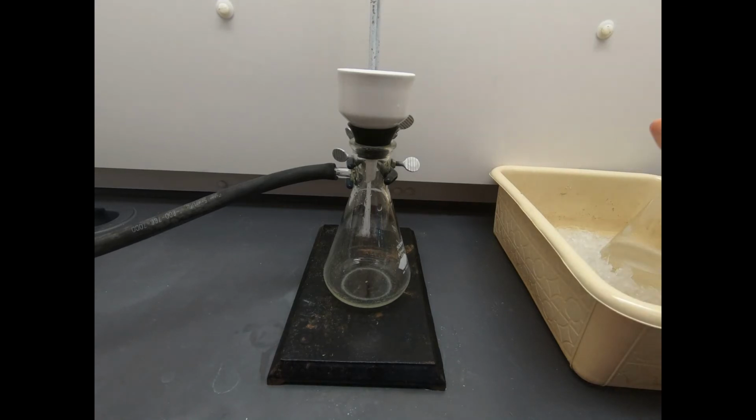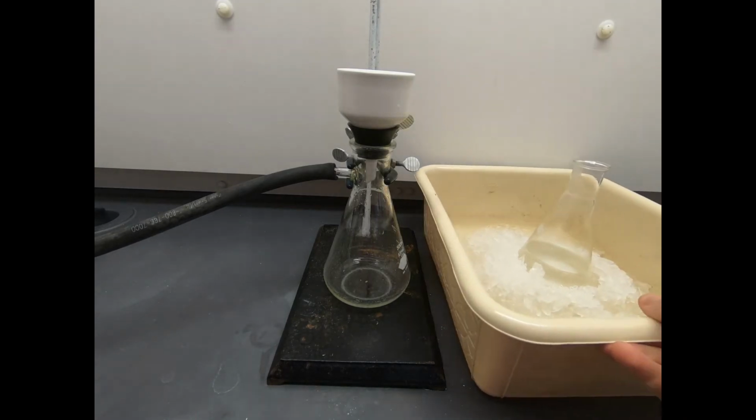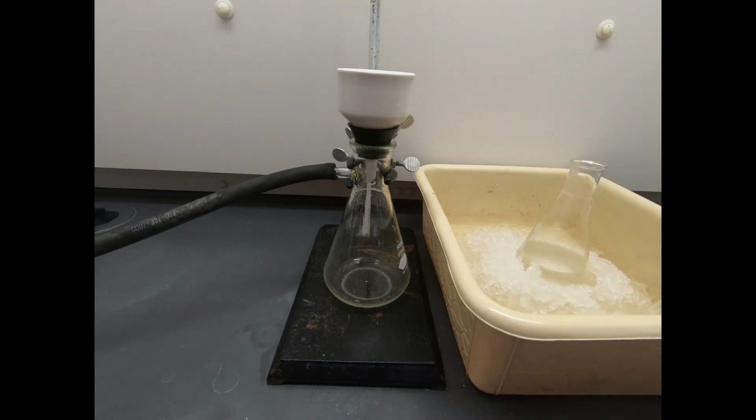Now notice I've left the solution, it's hard to see off camera here, but I've left the solution on the ice. Very often when students do filtrations, they say, oh, I'm done cooling this. And then they'll put it on the bench top and it'll start warming up. Well, what can happen as it warms up is you might start dissolving your material. So keep the flask on the ice. Don't put it on the bench top to let it warm up. You put it on the ice to keep it cold, and you want it to stay cold.